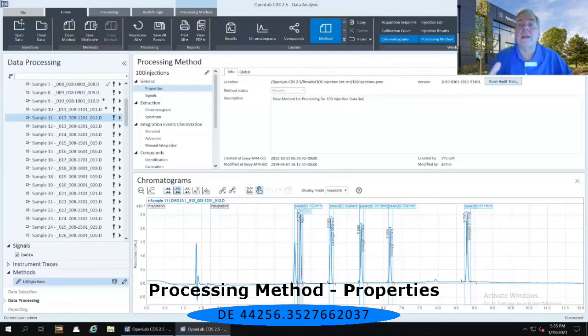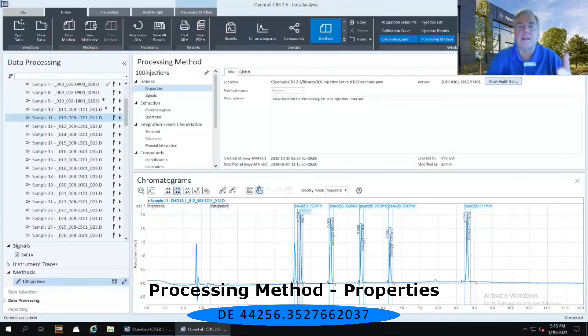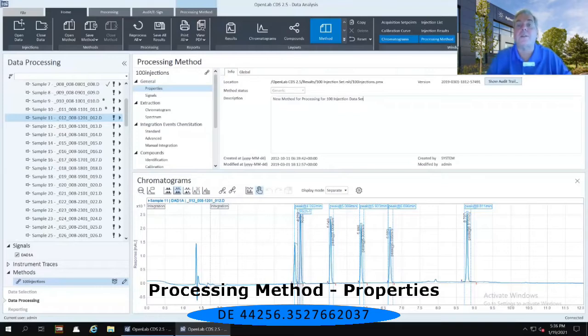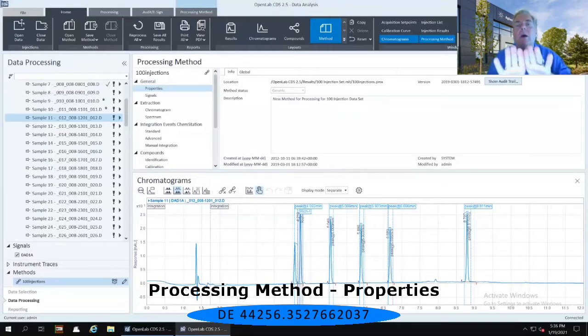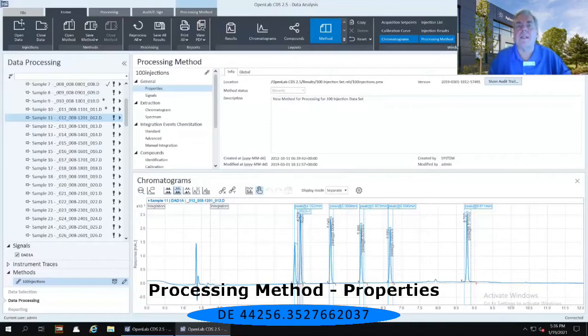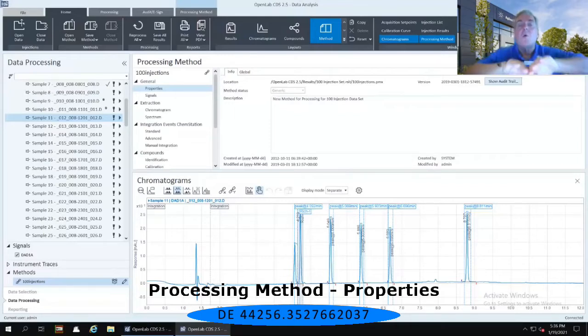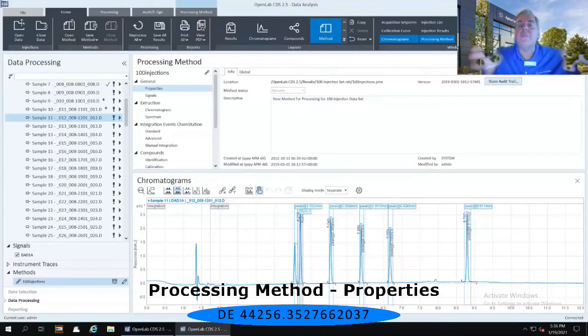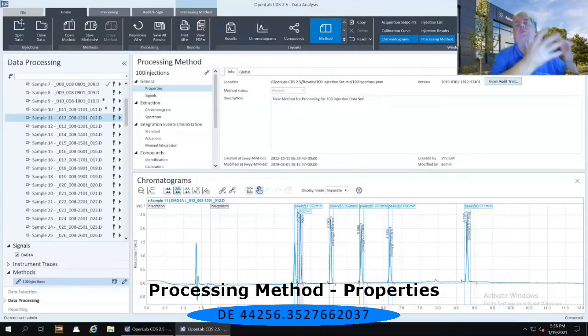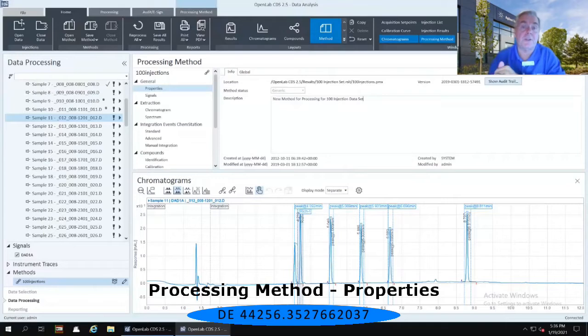So we are now taking a look at how am I going to be able to integrate it, to calibrate it, to create a report on this specific set of data. So that's why when we architected OpenLab CDS, unlike our predecessor products of either ChemStation or EasyChrome, we completely divested or divorced the acquisition portion of the software from the data analysis portion of the software.